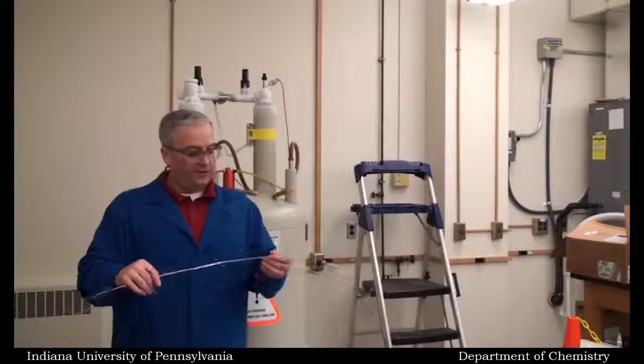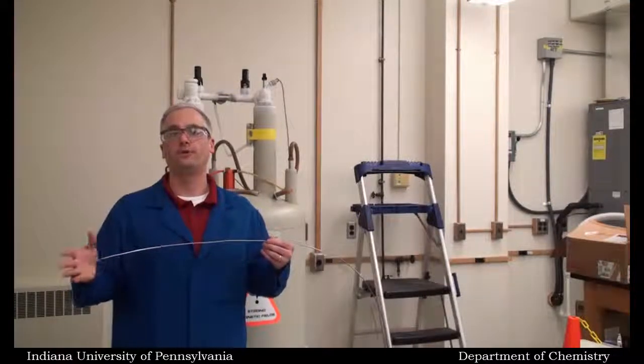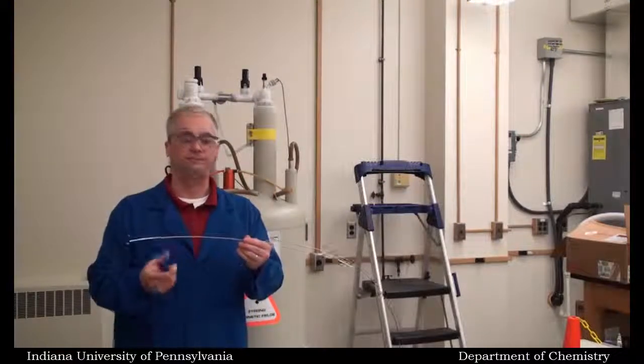So that's like my safety net, all right? So there's 2 main reasons. The safety net, and it makes the calendar process much easier to handle mentally. The other thing is the full magnet's going to be somewhere around 34 to 33 centimeters, all right? So when you know you're at 34 to 33 centimeters, you know the magnet's full.